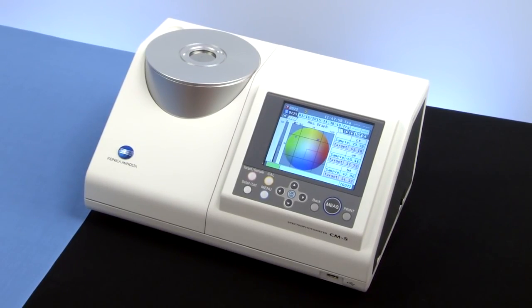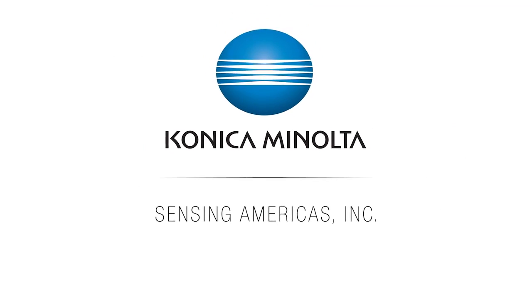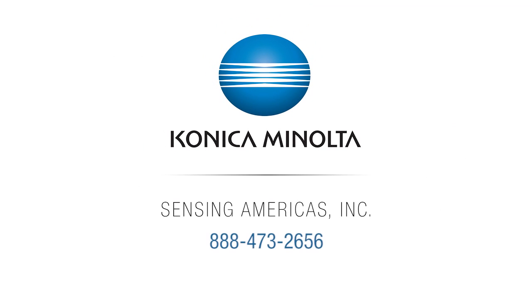Enhance your color evaluation program and easily adapt to any measurement requirement with the versatile CM5 Benchtop Spectrophotometer. To learn more, contact one of our color experts at 888-473-2656 or visit us online at sensing.konicaminolta.us.